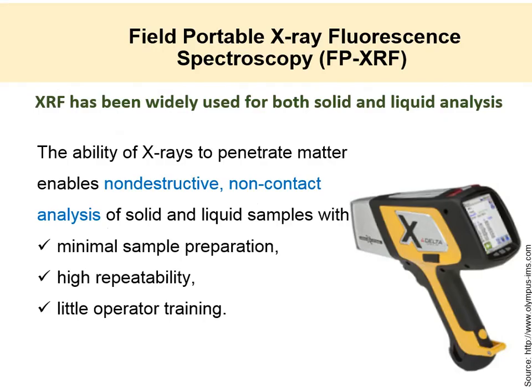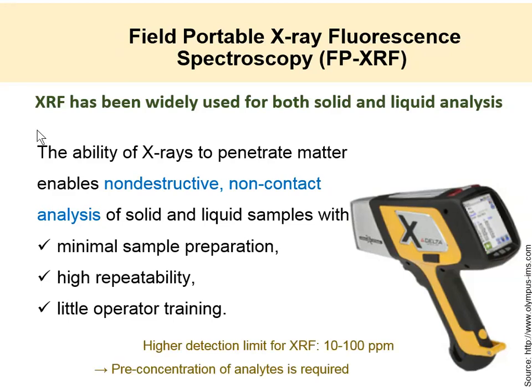So XRF has been widely used for solids, soils in our case, and less for liquids, but it's still possible. The ability of X-rays to penetrate matter enables non-destructive, non-contact analysis of solid and liquid samples with minimal sample preparation, high repeatability, and little operator training.